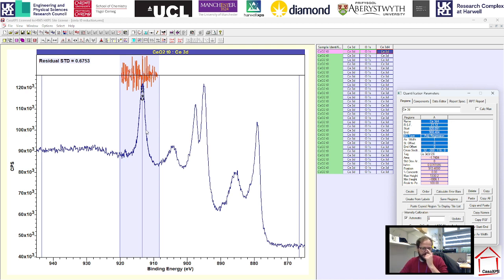So this peak is isolated from the rest of it. There's a lot of overlap between the other species in the rest of the cerium spectrum, so we can look at this one out here on its own to calibrate to.